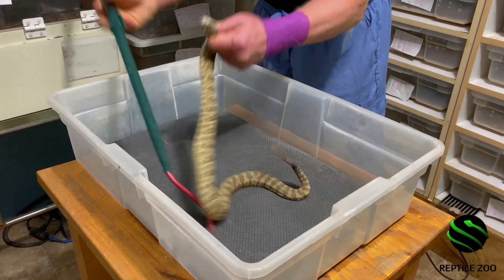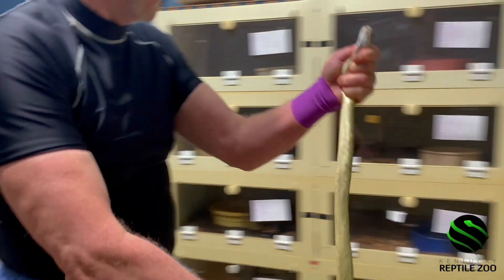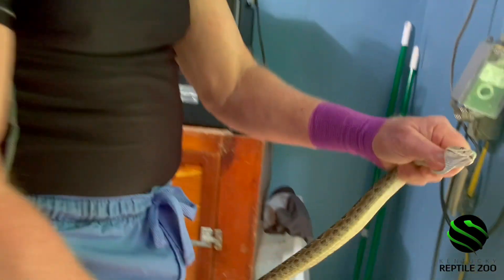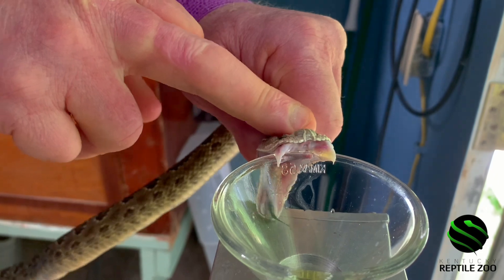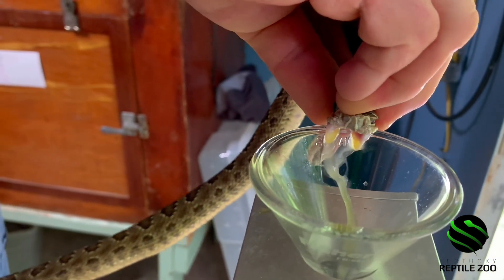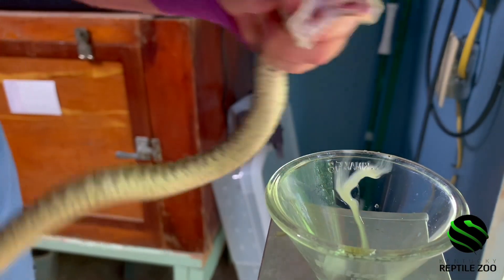I believe the males are on the bottom and the females are on the top. That's what I tried to do when I set it up — I don't know if they've been adjusted since then. It was half and half, or maybe four and six or something like that. This came from the retirement professor.